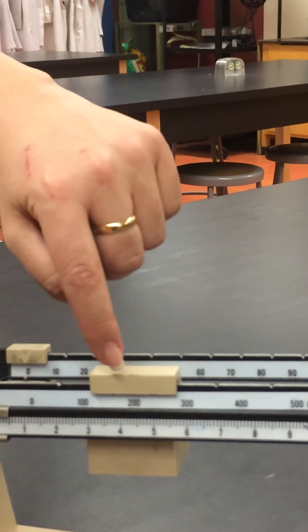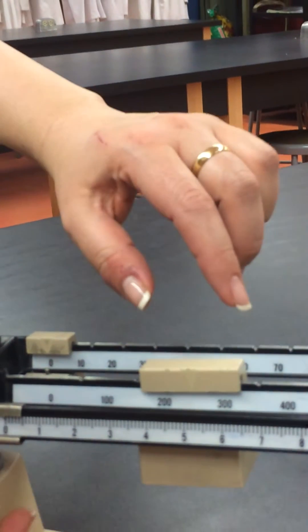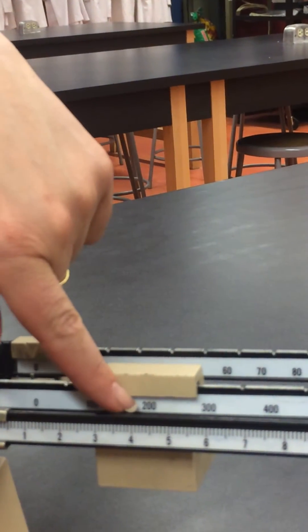And notice how the arrow is pointing at the number. Always. If you put it in the middle, it's wrong. It has to be right on the 200.